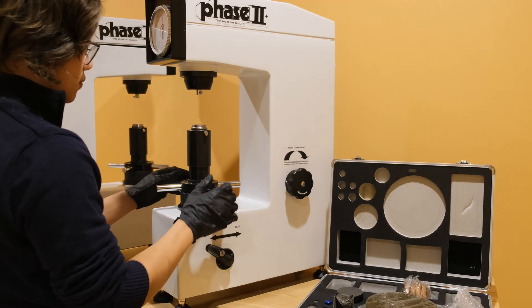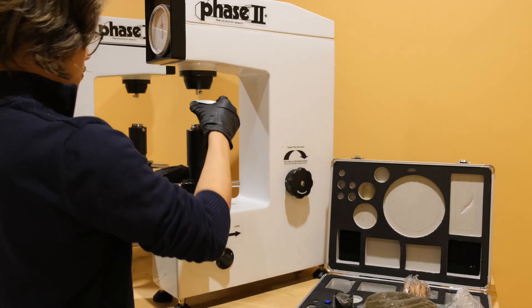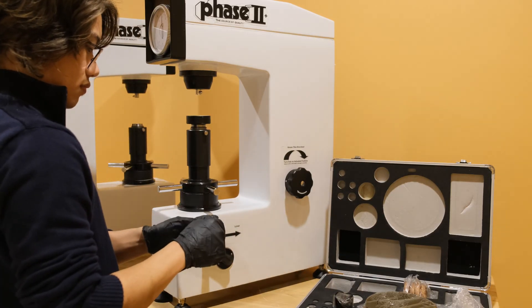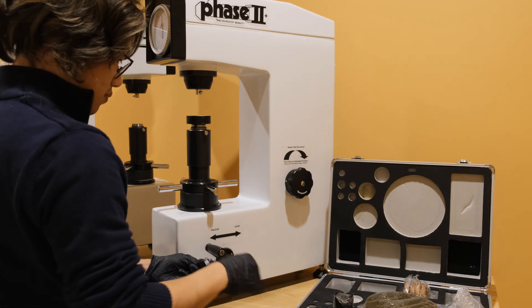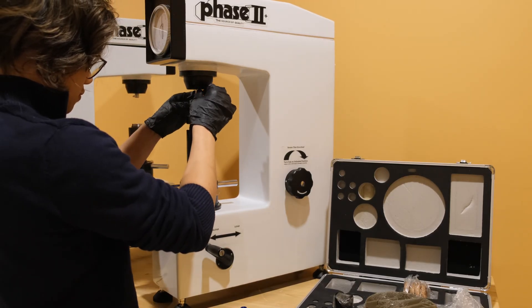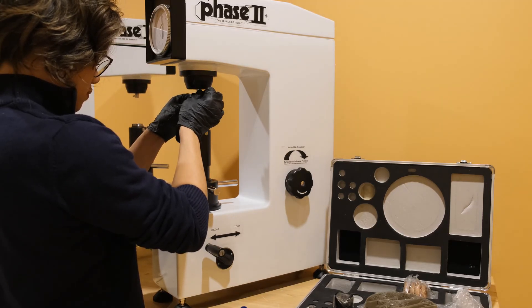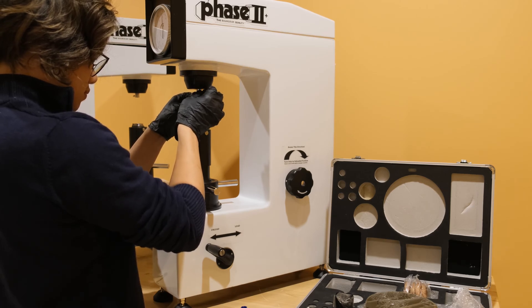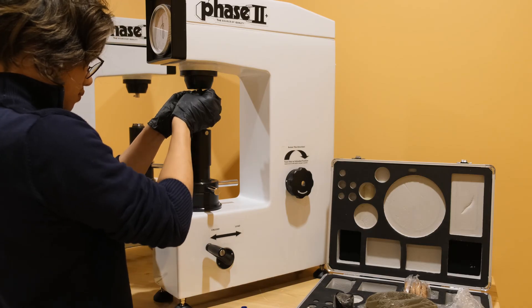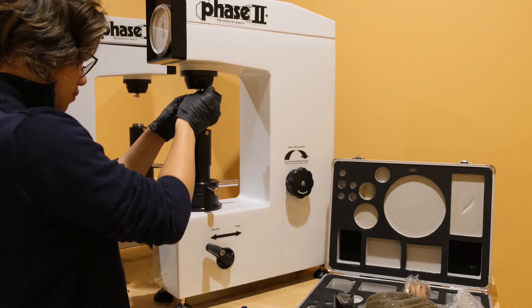Now let's move on to the operation of the hardness tester and see just how easy it is to utilize the different functions, taking tests and obtaining results. It is important to take into account the technical aspects of the machine. The maximum workpiece height is 170 millimeters or 6.7 inches, and the maximum workpiece depth is 167 millimeters or about 6.6 inches. The most prominent feature of this model is its very simple test cycle along with its cost effective nature, making it one of our most popular benchtop testers.